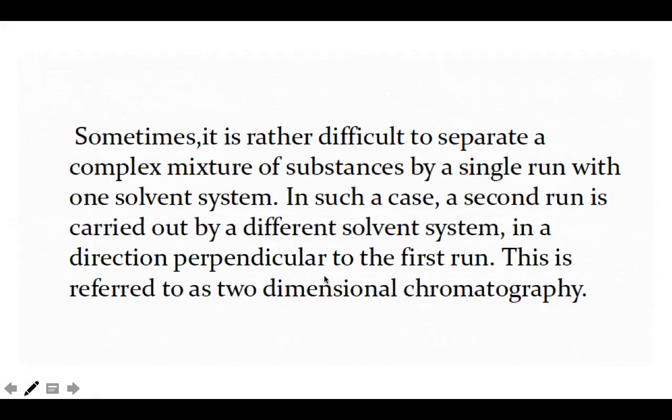So what is two-dimensional chromatography? Sometimes when we run a mixture of compounds in paper chromatography or thin layer chromatography, one run may not separate all the compounds. In that case, we may use a different solvent and place the plate perpendicular to the first run. As a result, we can find a new separation, and it is called two-dimensional chromatography.